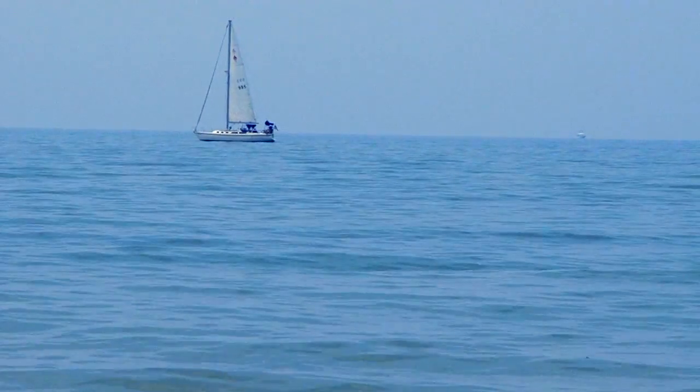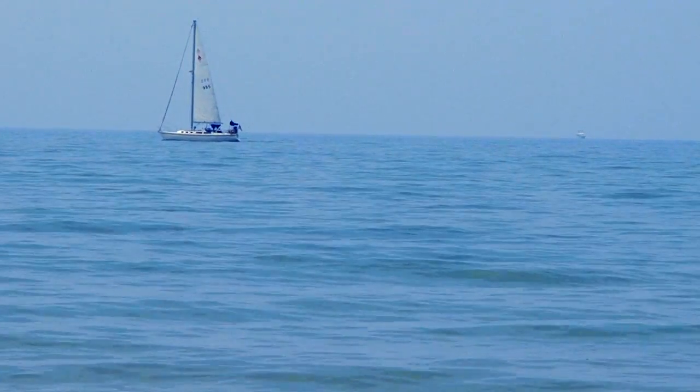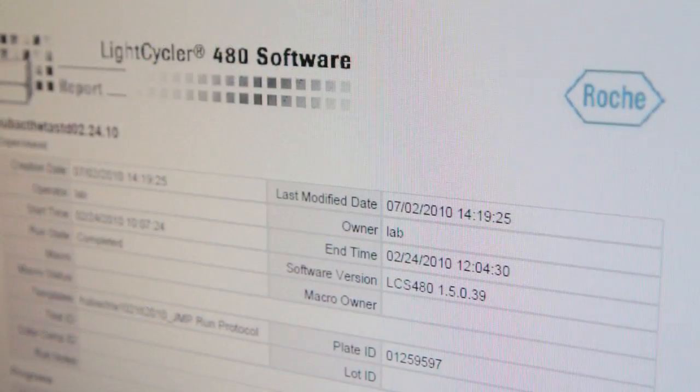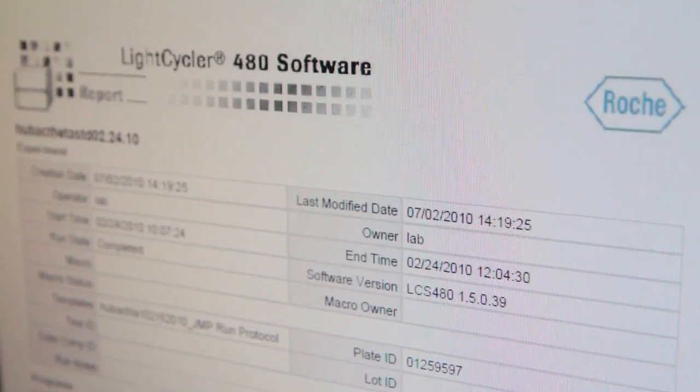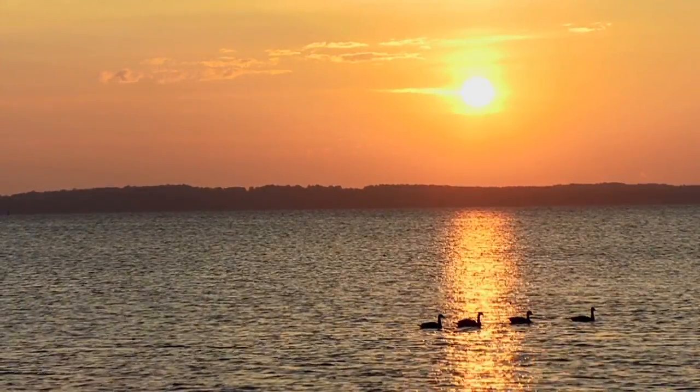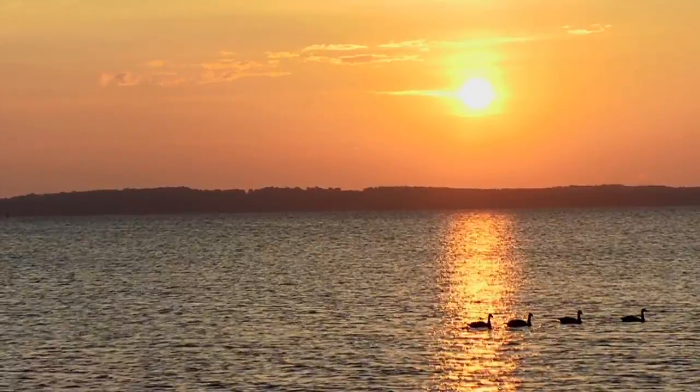The EPA is moving towards Enterococci qPCR testing for 2 reasons. 1, because Enterococci is more closely related to human illnesses from recreational waters than E. coli. And 2, because results are obtained in as few as 3 hours as opposed to 2 days, allowing for faster corrective action to be taken, and as a result, safer public waterways.